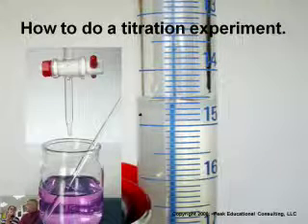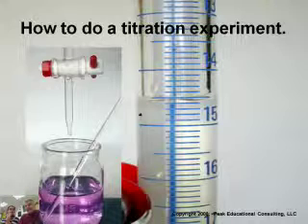Speaking of talking about that, I think it's going to best help if we actually show you an experiment. We're going to teach you how to do the titration experiment and actually then talk through some of the mathematics.